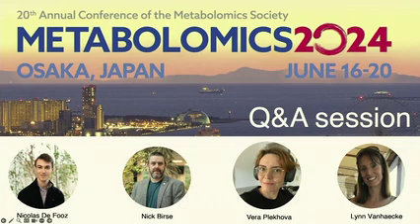But it's interesting to know. Do you have any? Yeah, I was just going to say, the thing to remember with all of the ambient sources where you're not doing extensive sample cleanup is you've got more matrix in there than you'd be used to with conventional LCMS, which is why there's an increased chance of exotic adduct formation and a slightly different ionization mechanism taking place.